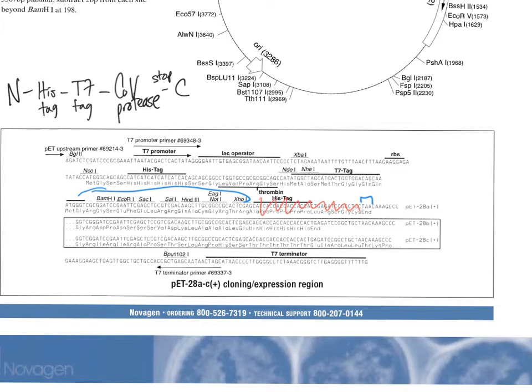The reason I always go left from right is that the closer you are, the less sequence you're going to clone in, so there are fewer amino acids included before your protease. The same goes for a BamHI-EcoRI clone or BamHI-SacI or BamHI-other, it doesn't matter. But if you put a stop codon right there, then you don't have all this other extraneous sequence. I like having as little as possible, so you can put the protease in there.